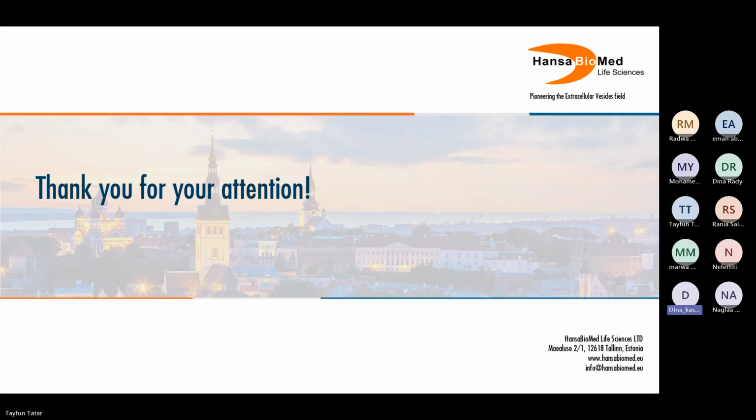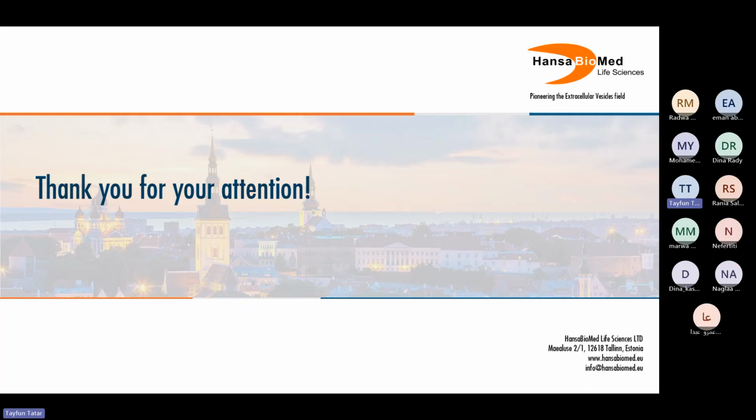Okay, so UV is not recommended in this context, because gamma irradiation is not something that's readily available in our hands in the lab. UV is generally not enough because these fibers have very small diameters. We are considering, let's say, 200 to 300 micron diameter fibers here, and the penetration depth of UV rays is not enough to clean such small diameters.